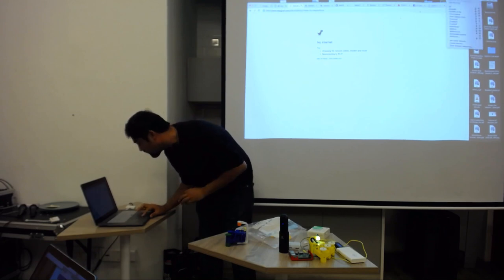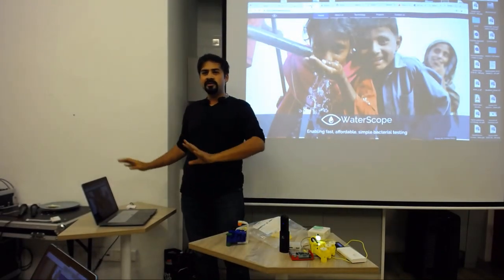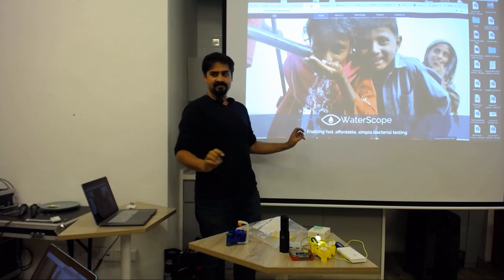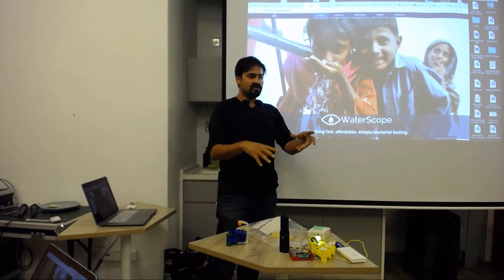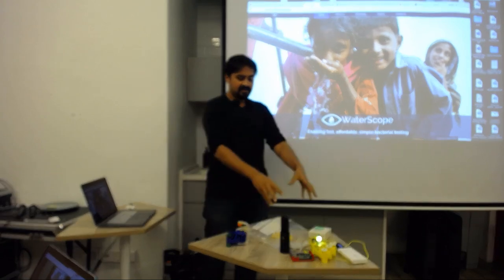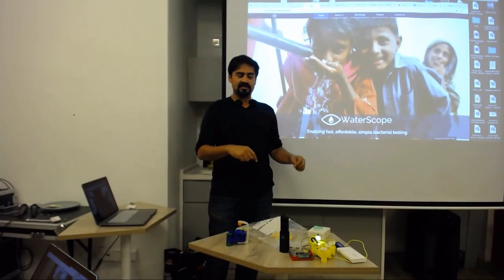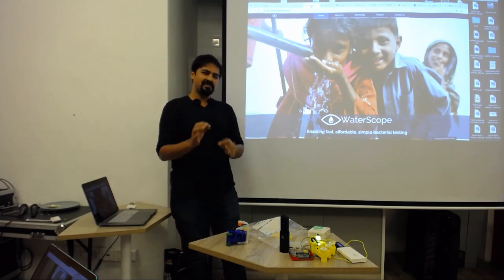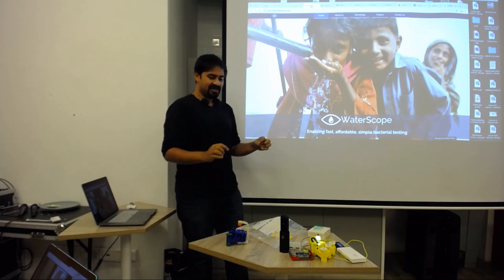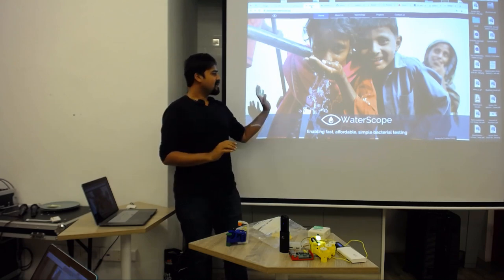I need Wi-Fi? No, I don't. It's fine. Okay. So, I have all these tabs open. My tabs are my slides. Okay? And then I'll show you this thing. What I want you to try, and I think I have enough time, is to see what this microscope actually does, and you can sit where you are and see it. So, you will need your phones later on, and it's a bit of a test to see how many people can connect to a microscope at the same time. But first, this is what it is.